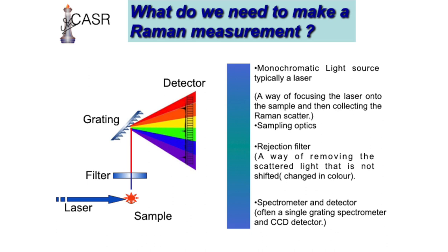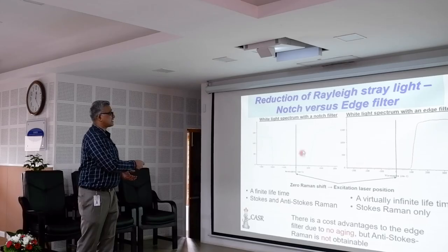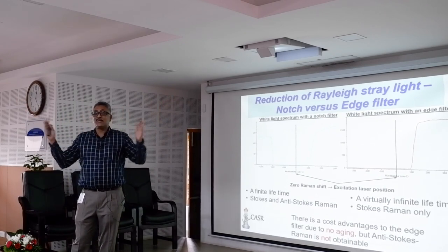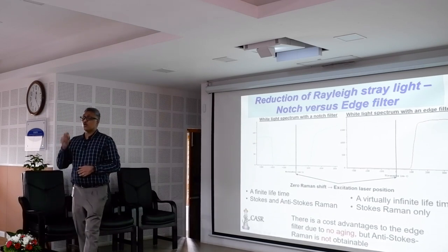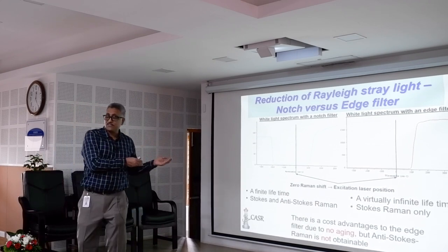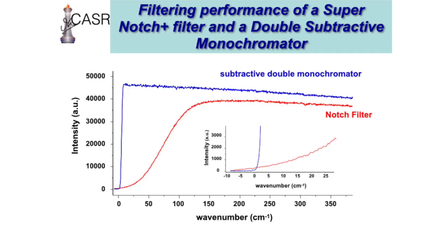All of these things are determined from these characters. Okay. So how does it affect? Basically, if I want to actually see the light, I should be able to filter the laser light accurately. If I don't filter the laser light, it is going to actually come out of the spectrometer, and that is going to affect my measurement. So that means we should be able to filter this light very accurately, and that's what makes a Raman spectrometer good. And when you filter out, you also remove Raman light, because there can be so much filtered or less filtered. So that also is a very important aspect. So you should realize that the filtering of the laser light has to be done. So you should know in your Raman spectrometer, how are you filtering the original laser light? Because that will tell you whether I can get anti-Stokes line or Stokes line, which is what I said, blue shifted light or red shifted light, or I can only get the red shifted light. All of these things are there. So these filters are very, very important to be looked at. I will not go into the detail.